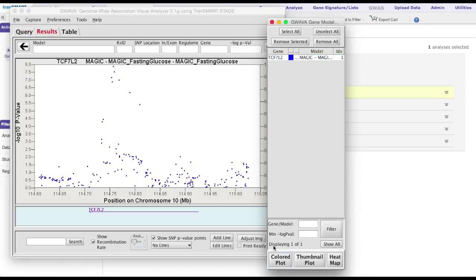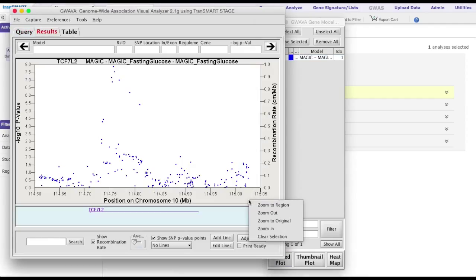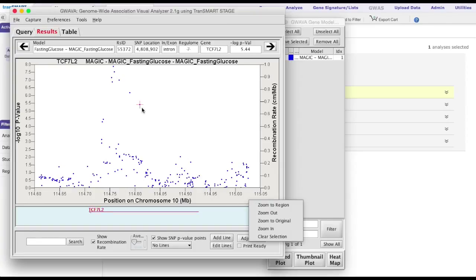The plot is interactive, where hovering over a dot will display specific information about that SNP. In this window, it is also very easy to identify genes.